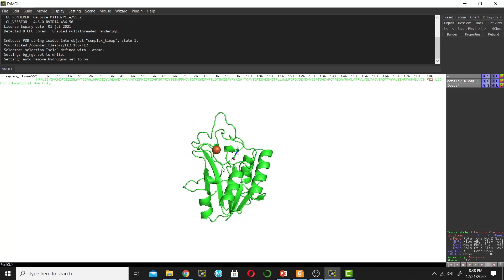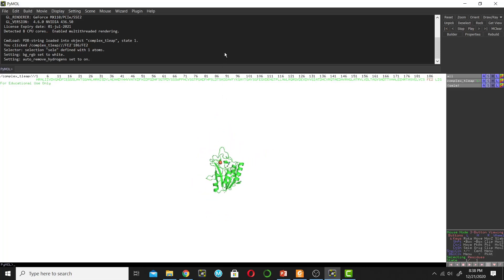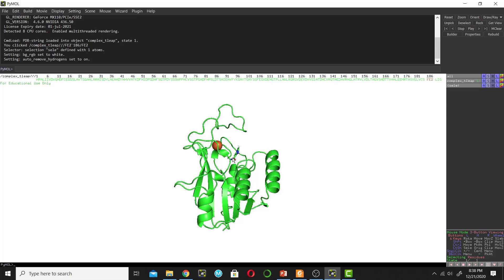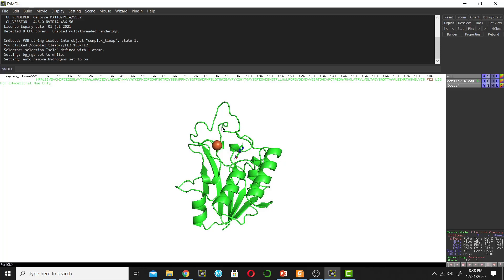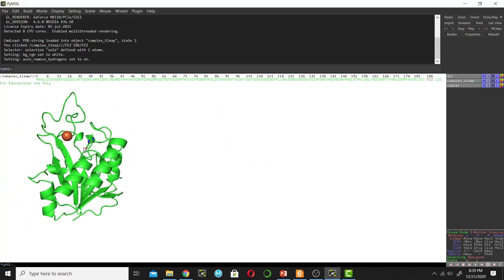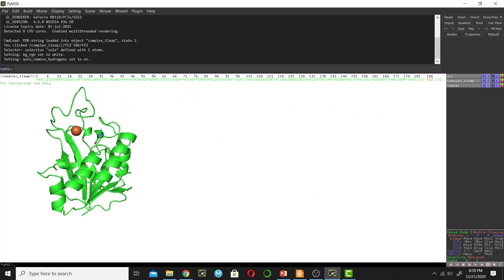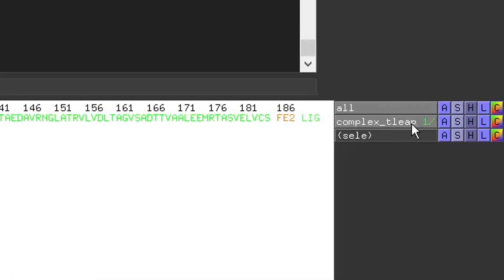Now I can do many things with this protein. To zoom in and out, click the right mouse button, hold it, and move your mouse upward to zoom in. To rotate the protein, click the left mouse button and move your mouse in different directions. To translate the protein around the screen, click the middle mouse button and move your mouse.